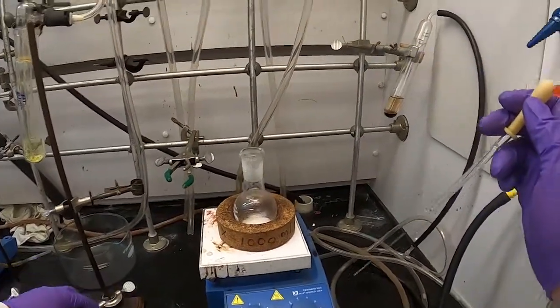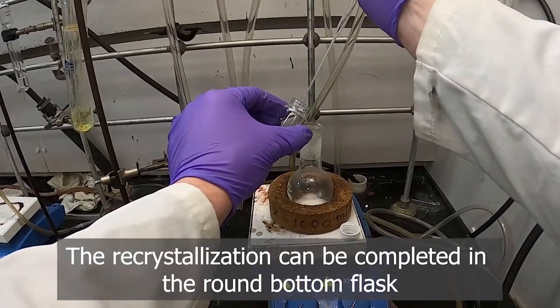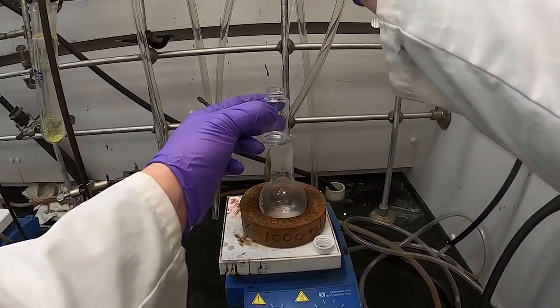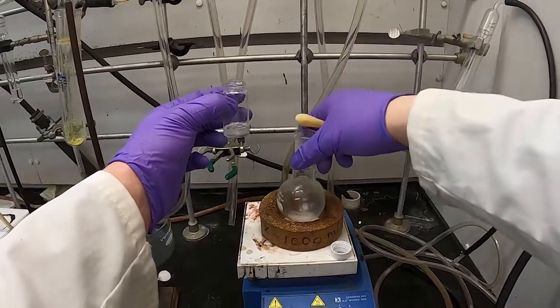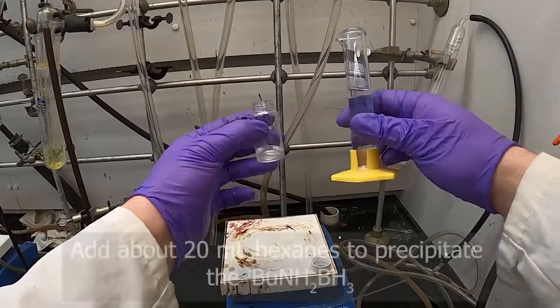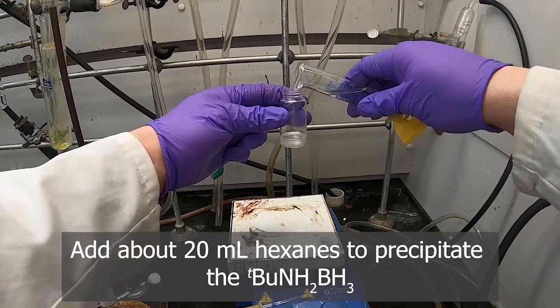So now I'm going to pipette this off into the vial here so that we can see the next step a little bit better. So now I have in this graduated cylinder 20 milliliters of hexanes. This might not all fit in this vial, but we'll see how much of it we can add before it overfills. We're doing this, adding the hexanes to our toluene solution to precipitate out our product.